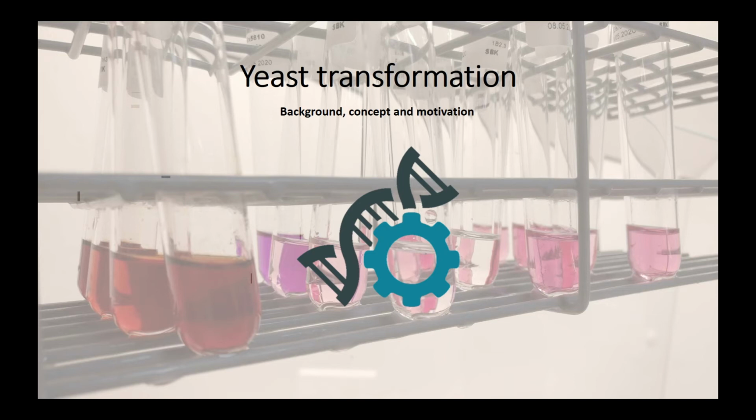Transformation is the process of altering the genetic content of an organism. So that means we can either add, delete, or replace a part of the DNA inside a cell. Today I'm going to walk you through the steps necessary to achieve this genetic alteration in our favorite microorganism, yeast.